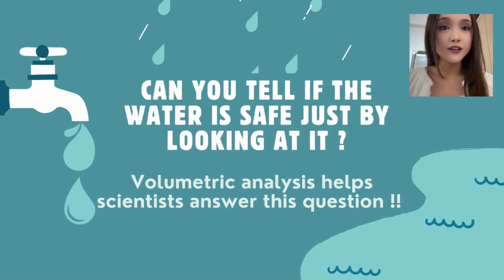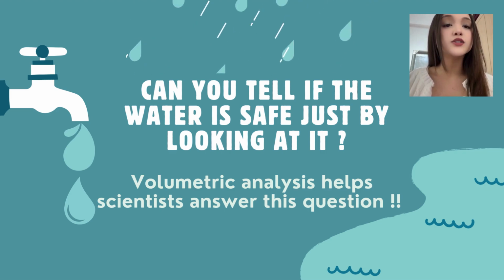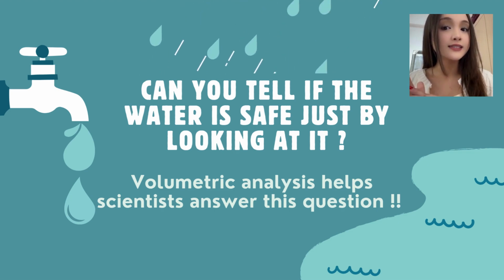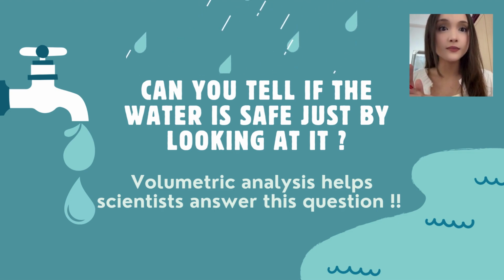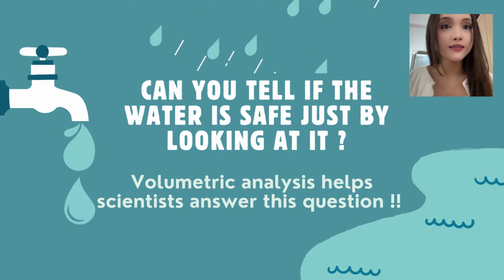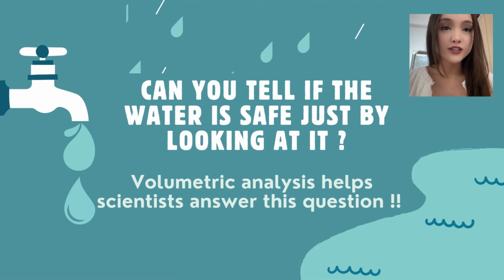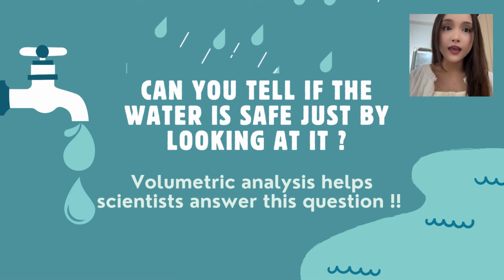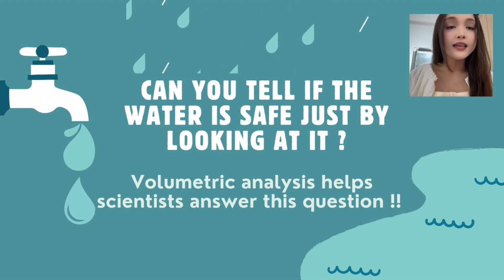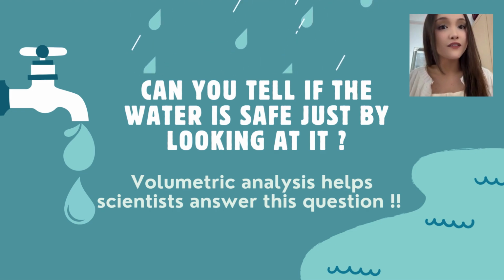You pour yourself a glass of water. Would you know if it contains too much chlorine or if it's too hard because of excess calcium and magnesium? Although we can't tell just by looking at it, scientists can determine this by using volumetric analysis. Today, our group will explain how this technique is applied in water treatment to ensure clean and safe drinking water.